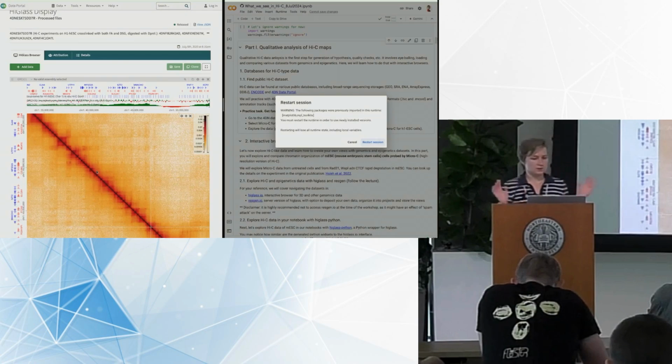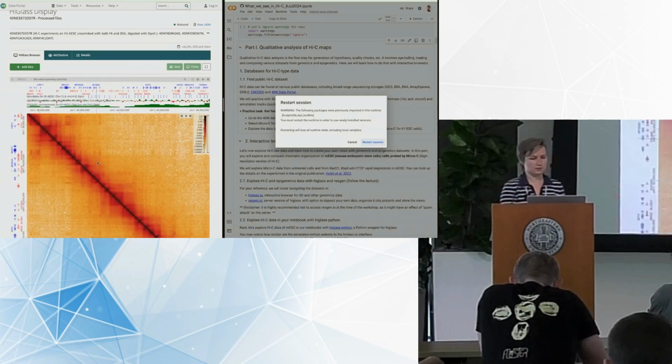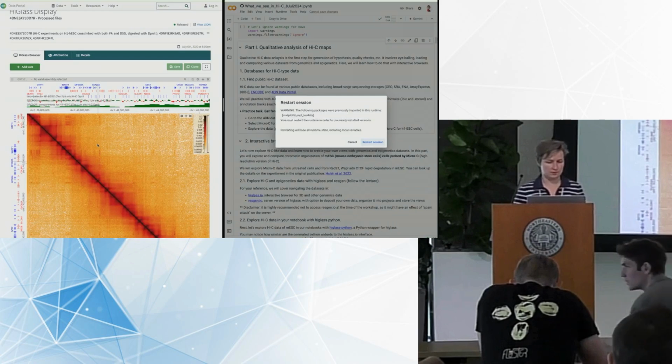So these are some examples of the features that you can find in Hi-C data. And this is a nice way to see them. Basically, you can browse them right away, find the gene that you like, or find some chromosome that you're curious about, or do simple quality control of this particular data set.